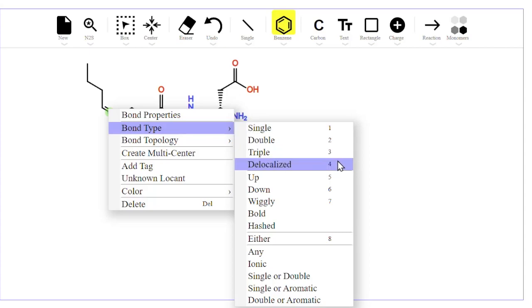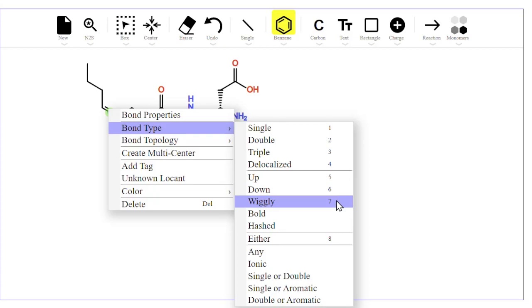If you're pointing at a wedge bond, 5 means up, 6 means down, 7 means a wiggly bond, and 8 means either/or for a double bond.